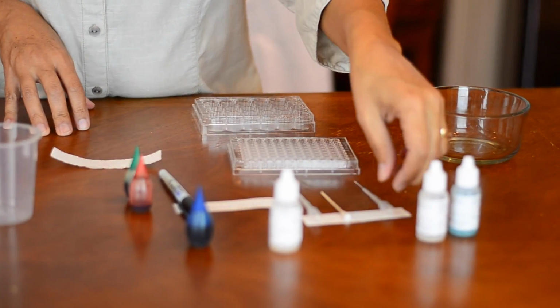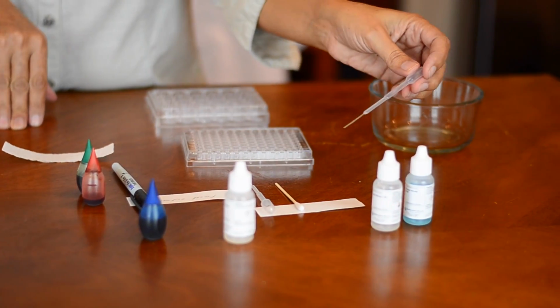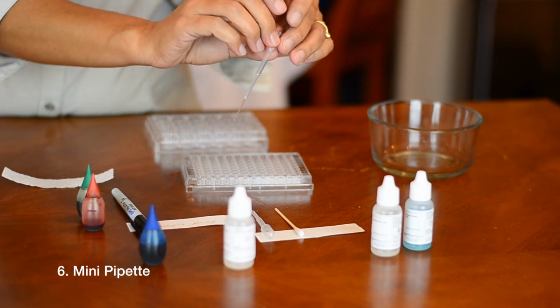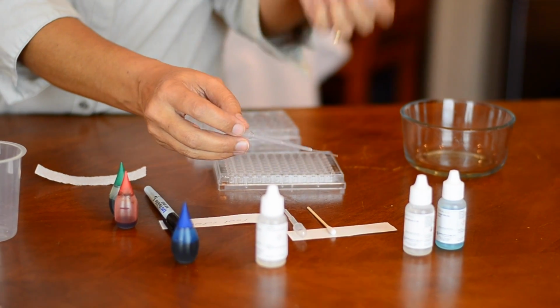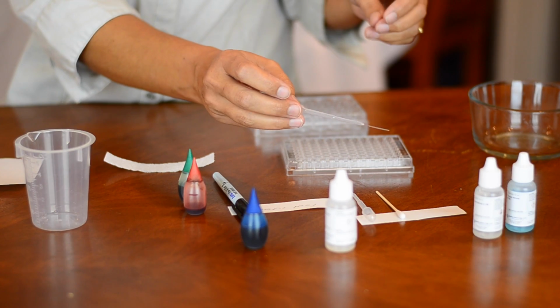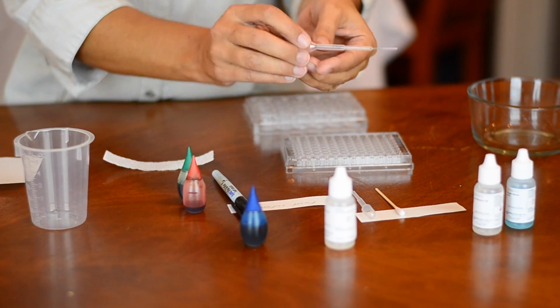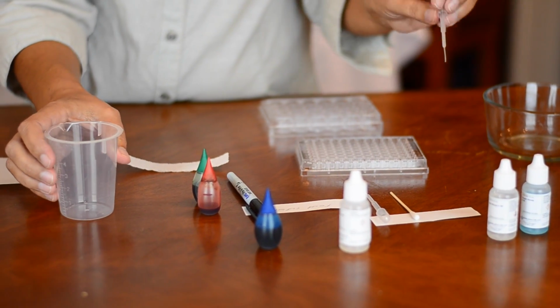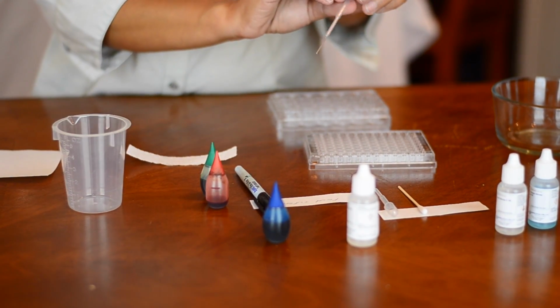To obtain our solutions out of their jars, we're going to be using what are called mini pipettes. It's important that you are careful with these. Pipettes are very commonly used in chemistry labs. They come in many different sizes and versions depending on what you need to measure. With these pipettes, do give them a good rinse between uses with some distilled water.